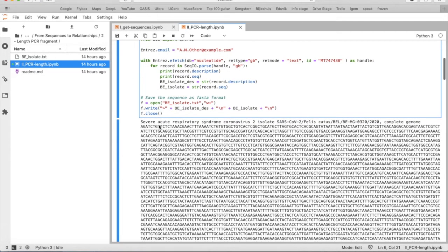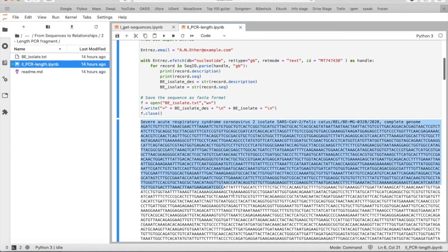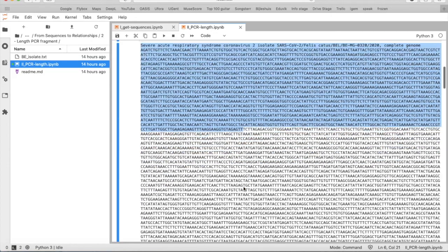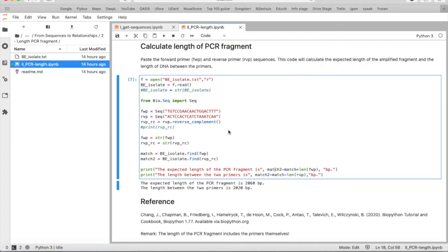If we print this file, we get this, of course. Okay, so now, this is the new part of this tutorial. So first of all, we need to open the BEIsolate file.